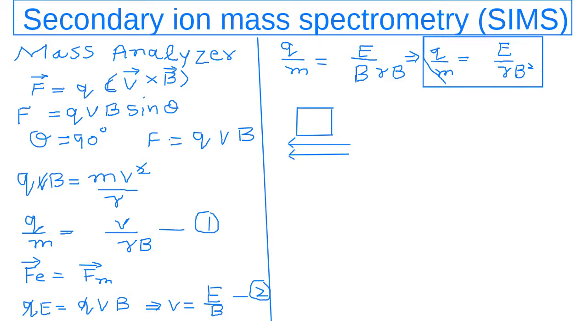So what is this? This is the value of E, no? And then the ion which is coming from here, that we have to see: how does it go around this region? So let's have a closer look at this, although this is having width. Or we can just draw it with the hand so that we can understand.